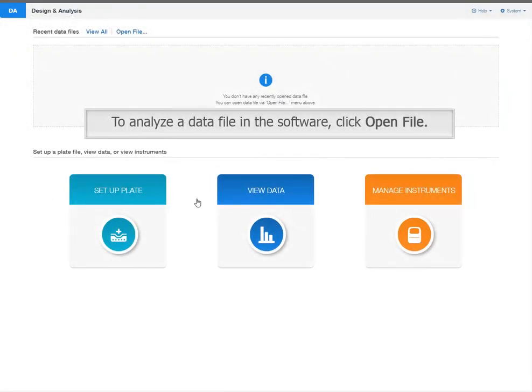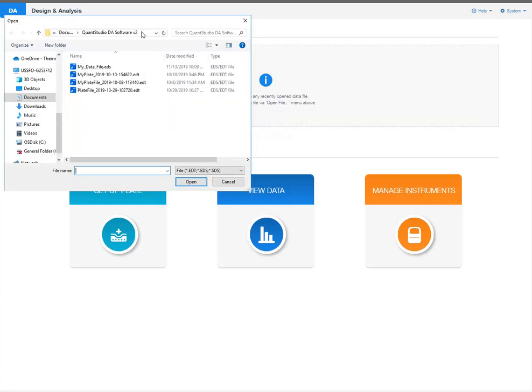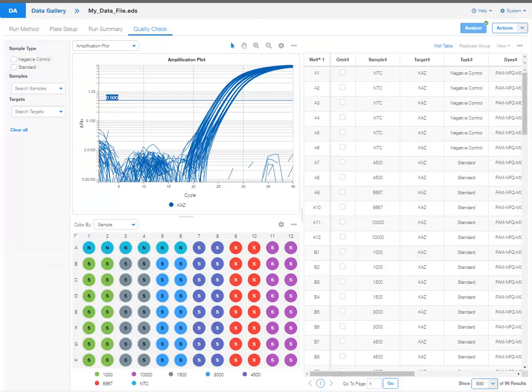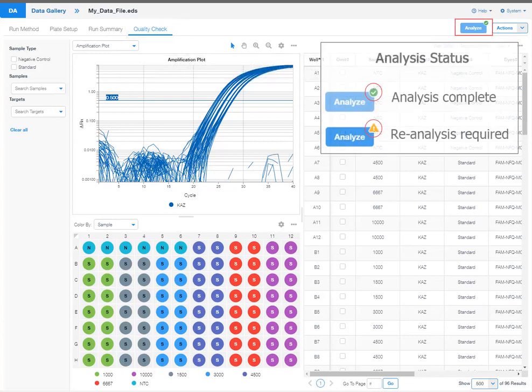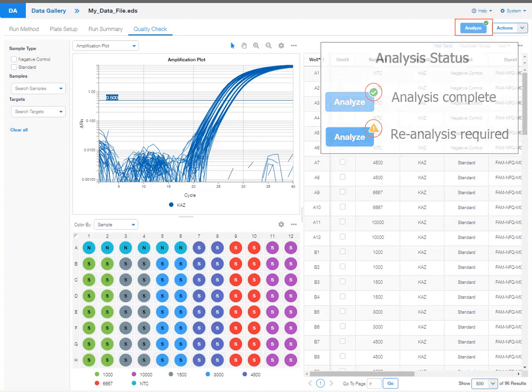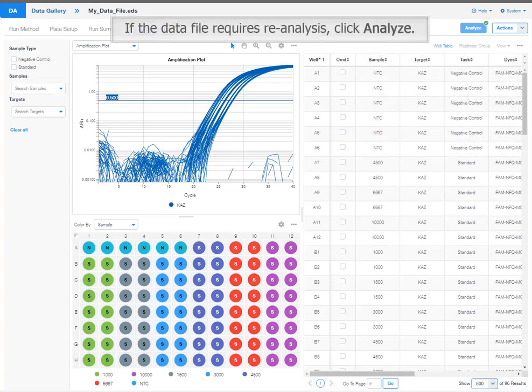To analyze a data file in this software, click Open File. Select a data file to open. The data file opens to the Quality Check tab. The analysis status is indicated by the icon in the corner of the Analyze button. If the data file requires re-analysis, click Analyze.